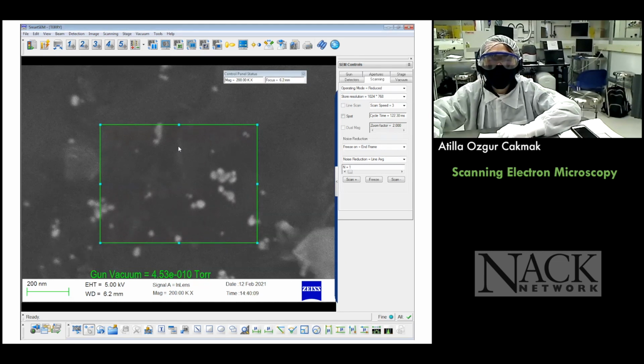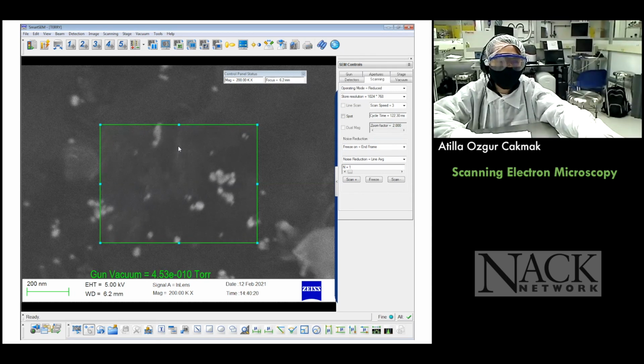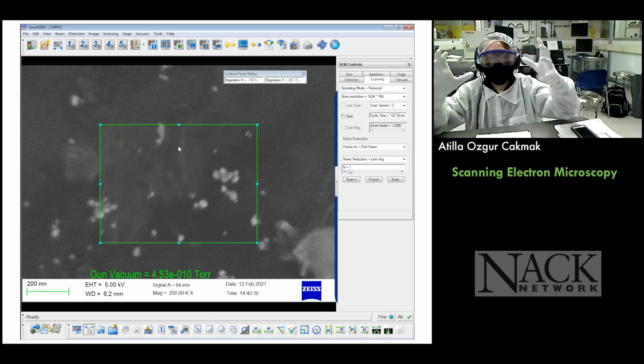So do you guys remember June? She was the person who first looked into these coronaviruses. She used these kind of nanoparticles, and she attached them to the viruses to see them clearly. Why? You see that the nanoparticles, because they are metal, because they're conductive, actually give you a lot of light.